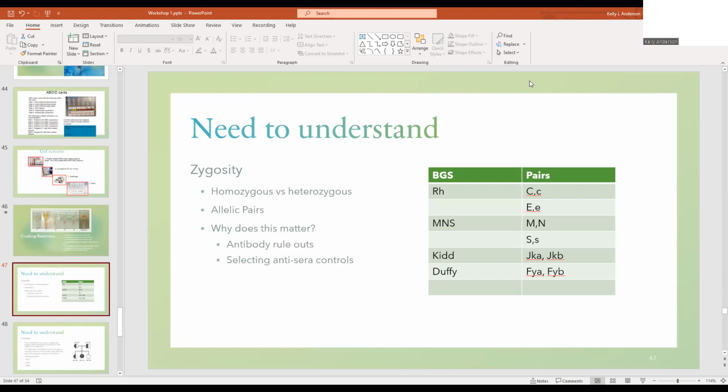Does it come to a stop? Then how do you know that's the right amount? Well, you just push down. There's only one push down. That's what I'm saying, you use that first stop and that's the amount. But you still have some in your tip, right? So these are all patient plasma, so you fill up your tip, and then each touchdown dispenses the set amount.